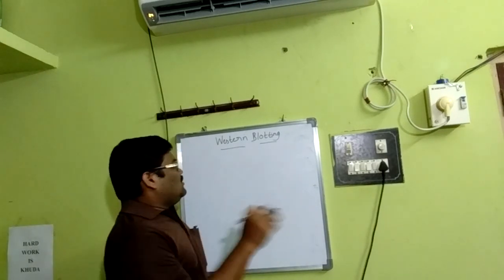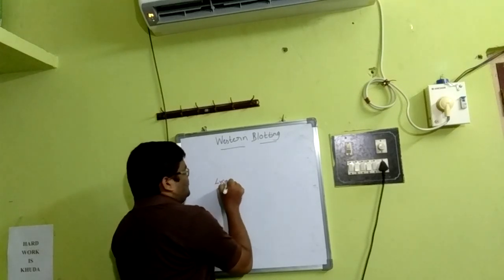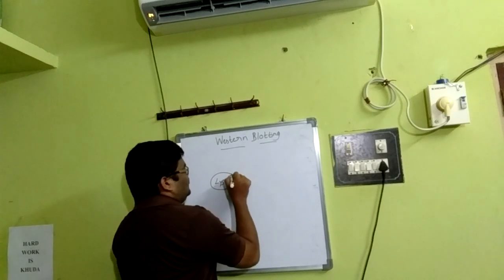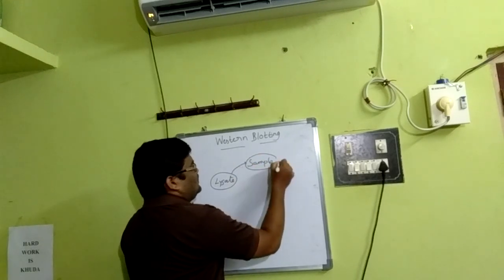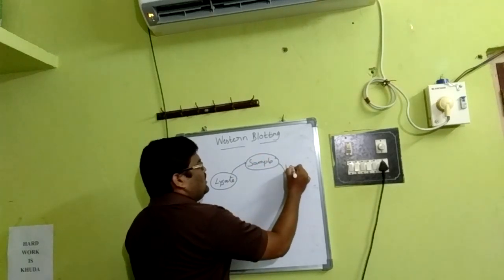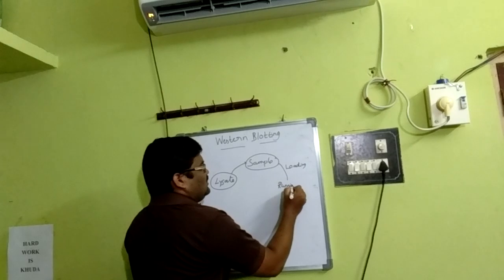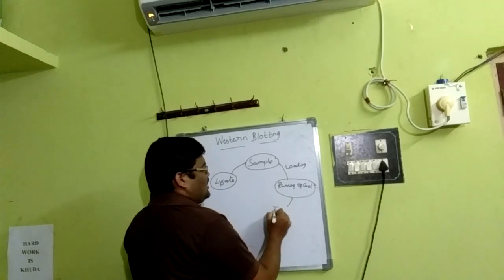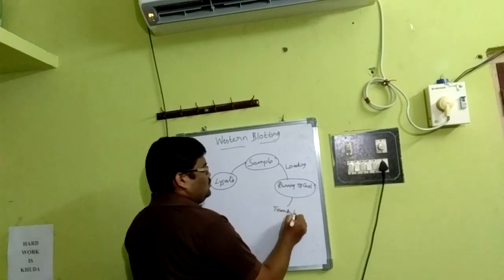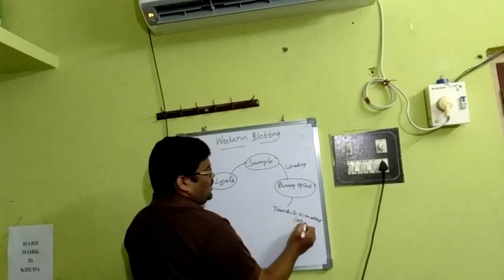First, we'll discuss the basic protocol. Say preparation of lysate, then the sample, followed by loading, then running of the gel, then transfer to nitrocellulose membrane or PVDF, polyvinylidene fluoride membrane.